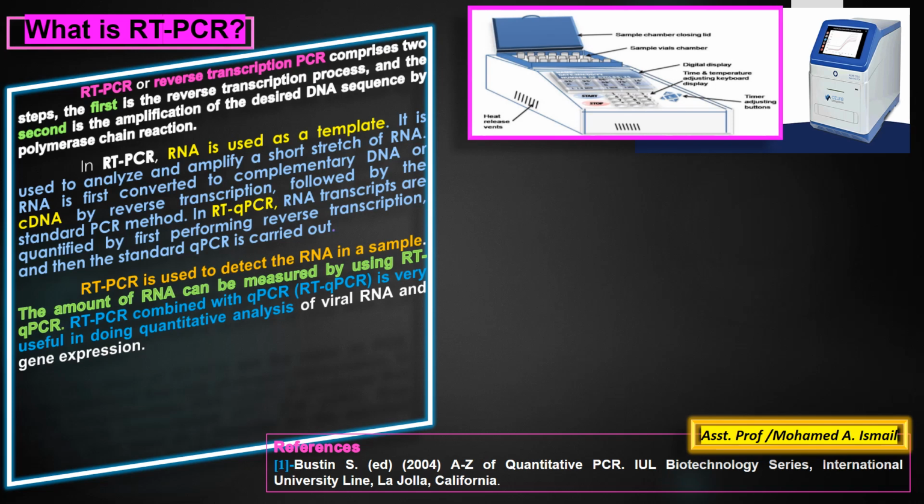The steps of RT-PCR are the same as PCR with the additional first step of reverse transcription.